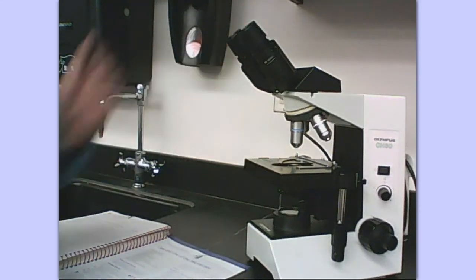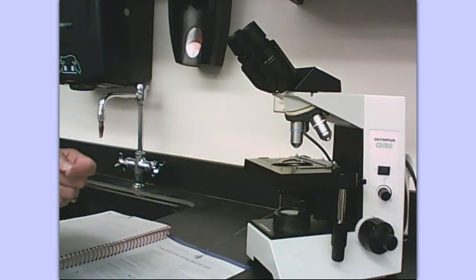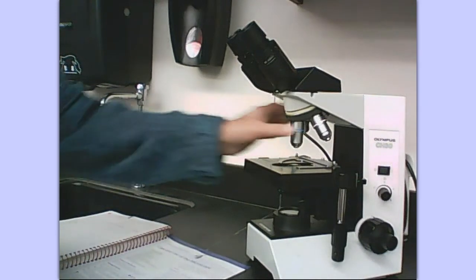Forty times ten gives you four hundred times total magnification.